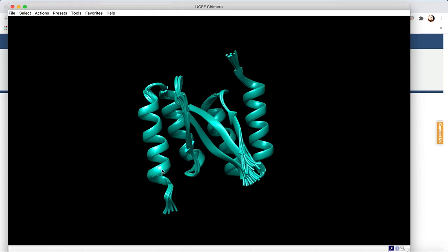So this one here is the affibody, and it belongs to chain B. The beta hairpin here belongs to chain C, and another fragment of the affibody belongs to chain A. So we'll just need chain C for this analysis by the SHIFTX2 chemical shift predictor, and also just one conformation, which is the most representative conformation of the beta hairpin.